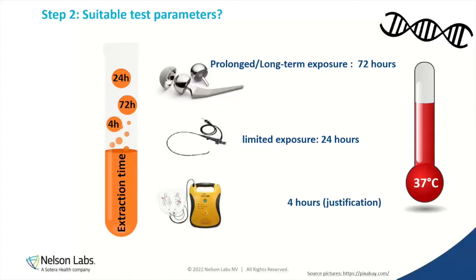But Lisa, can I just say, I immediately want to go to 4 hours because that's exaggerated enough? My device is only used for 1 minute. Ideally, I would like to do that. I would say my device is only used for 1 minute, so 1 hour, 3 hours. I hear you laughing. From my point of view, I would say I could avoid a lot of cytotox failures potentially by just reducing that. But yeah. I know, and that's the answer.